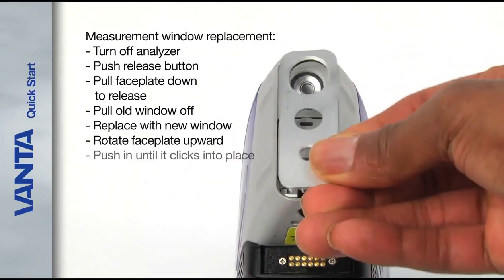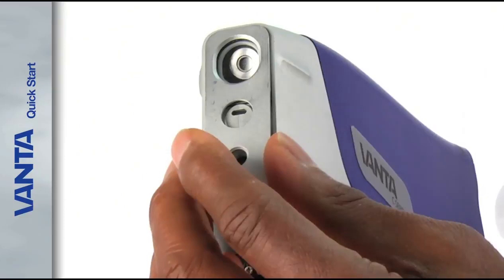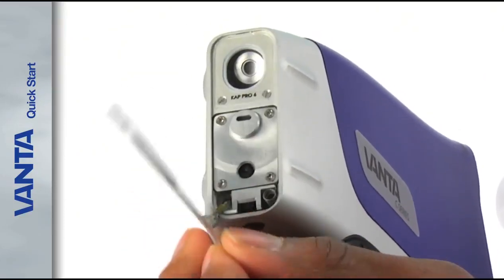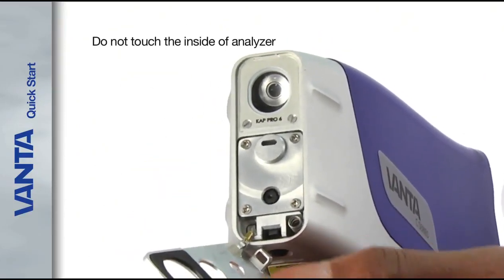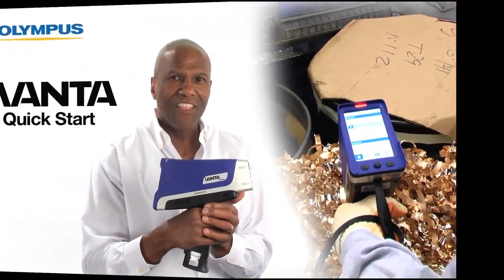Rotate the faceplate upward and push in until it clicks into place. To avoid expensive repairs, be careful not to touch the inside of the analyzer or allow dirt or other objects into the analyzer.